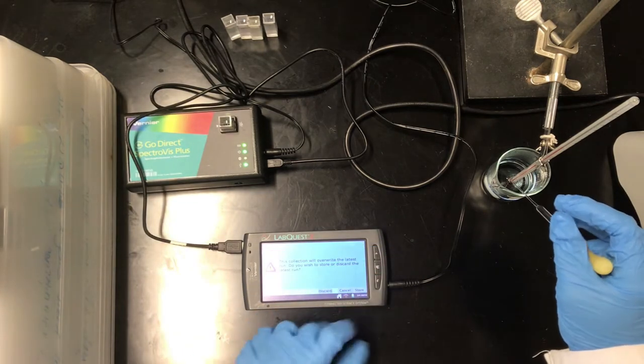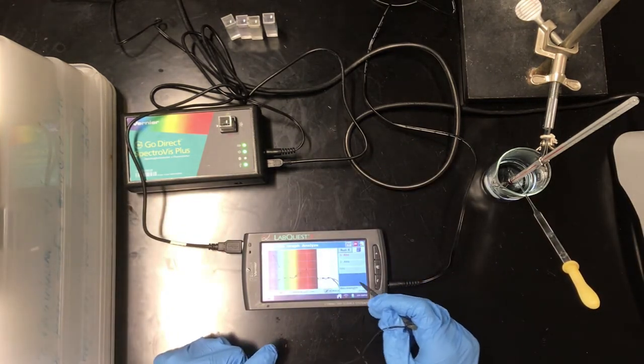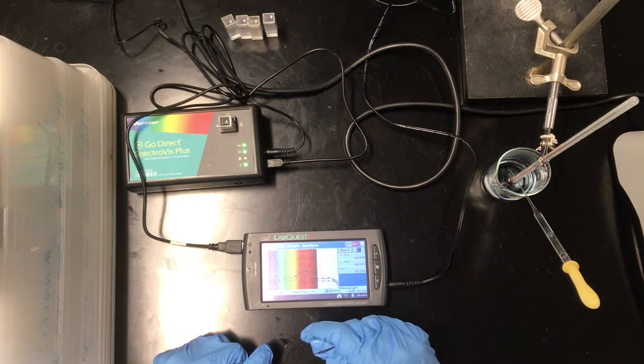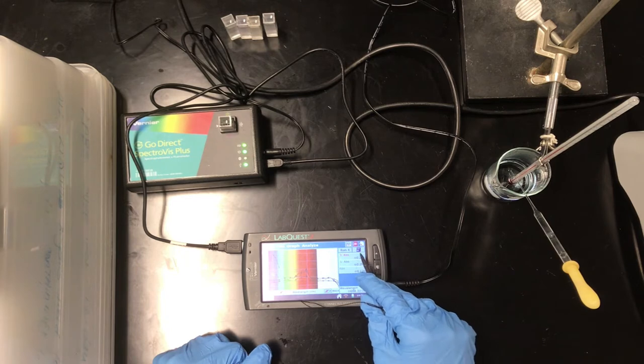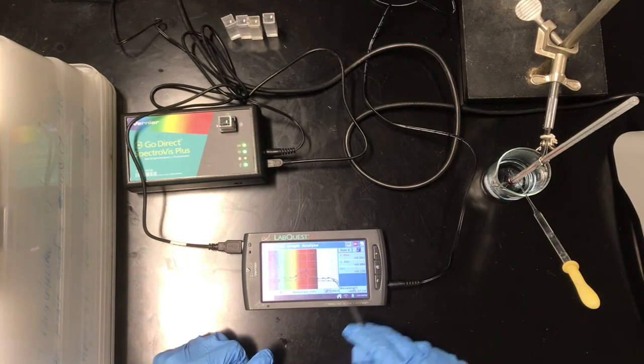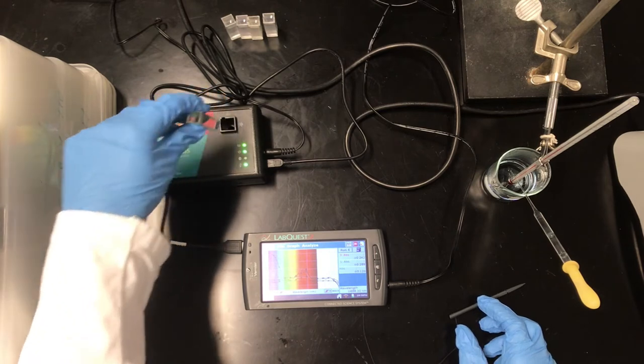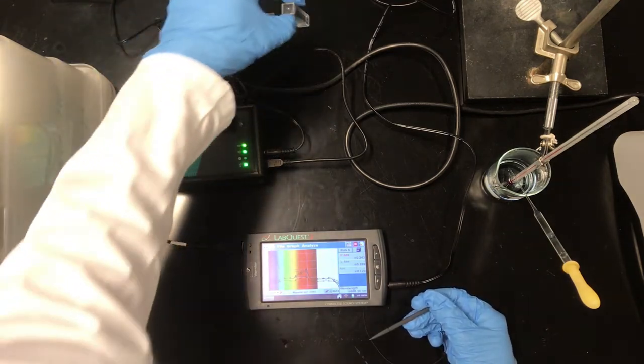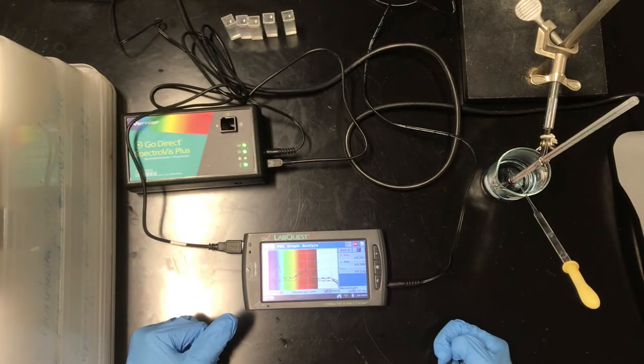Okay, so we'll go ahead and hit play, and we're going to store the last run, as we did previously. And once again, if all goes according to plan, we're going to focus our attention on the region around 690 nanometers. So a pretty significant change has happened with run 4. We've gone from right around in the 690 region 0.28 to 0.24 to 0.12 now in run 4, and that peak in the purple region again has completely disappeared, which was the same as the previous run. And so we're seeing a decrease in absorbance at that 690 point, which indicates a decrease in the concentration of the product. Even if we can't see the reactants just yet, we can use this as evidence that the product is disappearing.